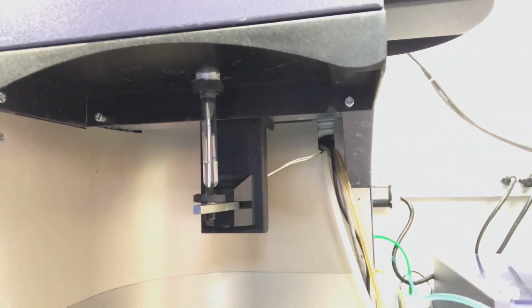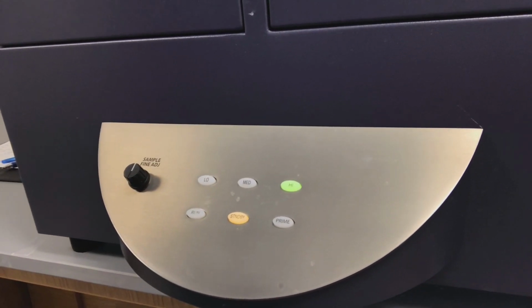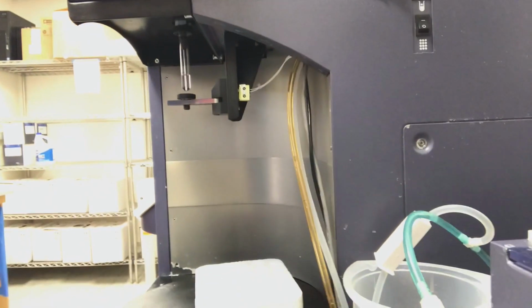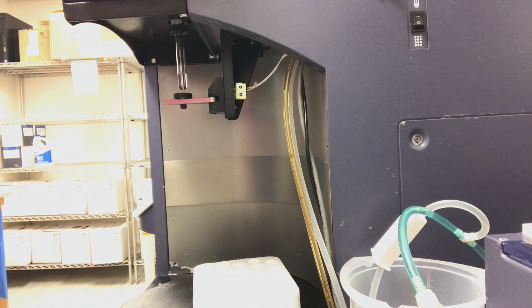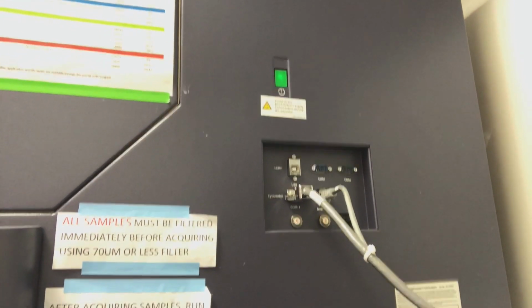Once you're done running your water for 5 minutes, you can leave the water tube loaded and place the machine in standby. In fact, at this stage, the machine is ready to be passed on to the next user. If we were done for the day, then we could power off the machine using that button, that green button.